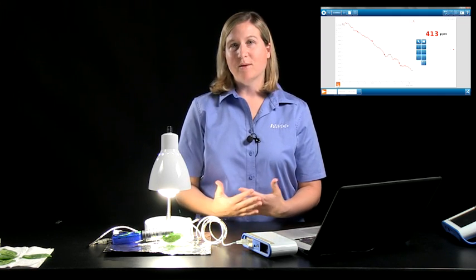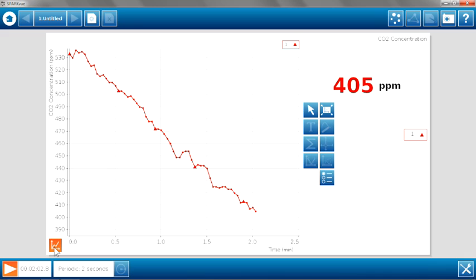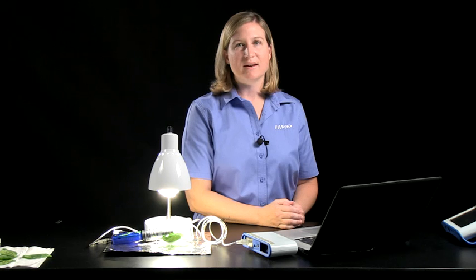For the purposes of our presentation today, I'm going to go ahead and stop data collection and move on to the second part of the lab. With the paper lab, if you're following those directions, the time for data collection would be between 5 and 10 minutes. To stop data collection, I'm just going to push the button in the lower left corner here. And you'll see the time stopped. The time was running during the time of data collection and now the clock has stopped, showing that my data is no longer being collected.